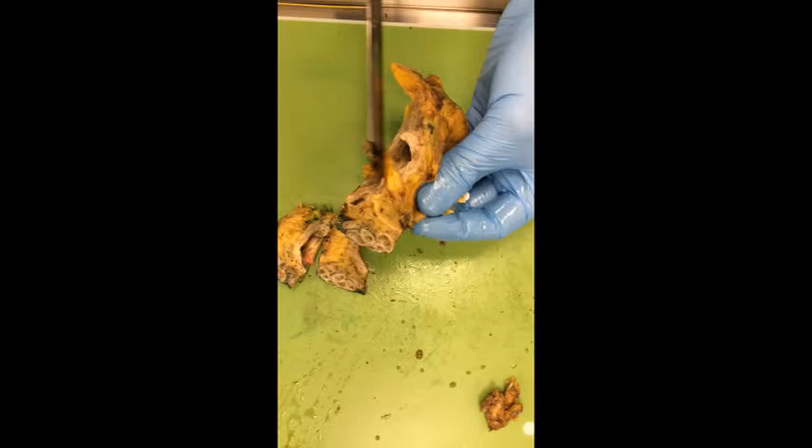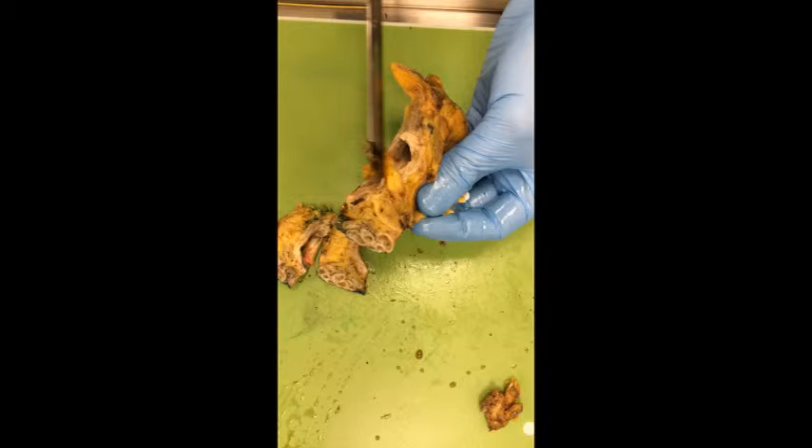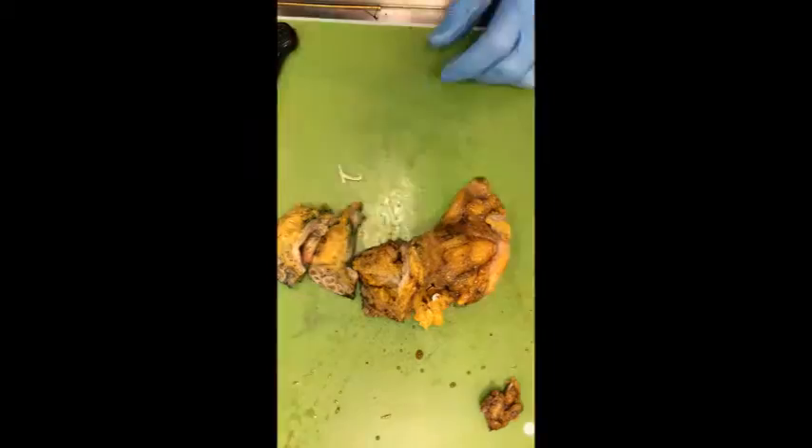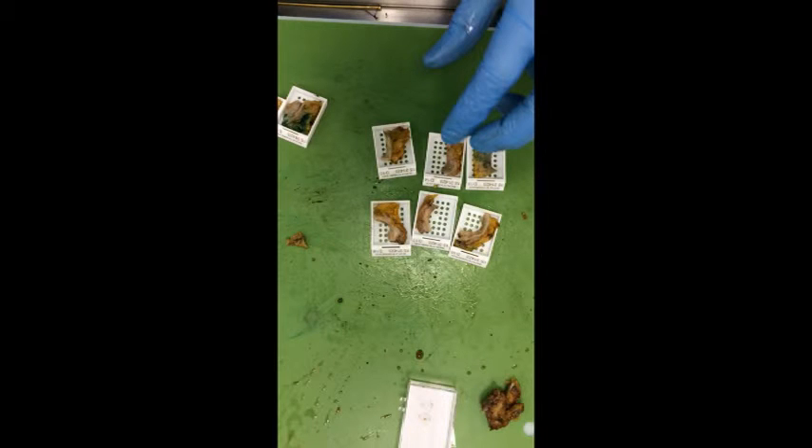Extensively sample the bladder including the ureteric orifice. Here is the ureteric orifice on the other side and the ureter can now be identified; this is removed and placed in a cassette with a tube label. Extensively sample a bladder which has no obvious tumour, especially areas of ulceration and flattening of the mucosa.